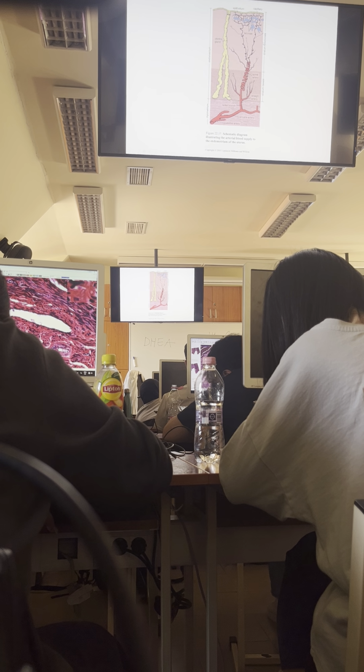Okay, now as we stated, the basal layer stays, and therefore the endometrium can regenerate because the basal layer contains all the essential parts of the endometrium from which the whole endometrium with all its structures can regenerate. Because here we have the straight artery which remains, it can further give rise to spiral arteries in the next cycle.